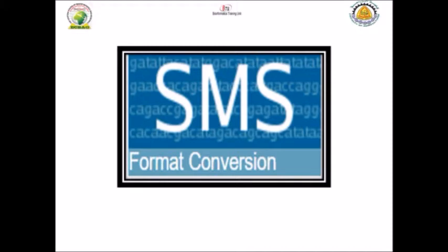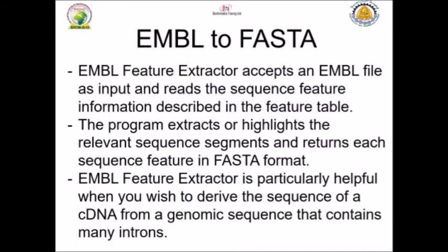This tool is available in the SMS suite, Sequence Manipulation Suite, in the format conversion section. It is very simple to extract this feature from your file. After downloading your EMBL sequence file, which has a lot of information that you may not want to use, this simple tool can extract just your sequence in the FASTA format. In other videos we'll cover other features that can be extracted from EMBL files.